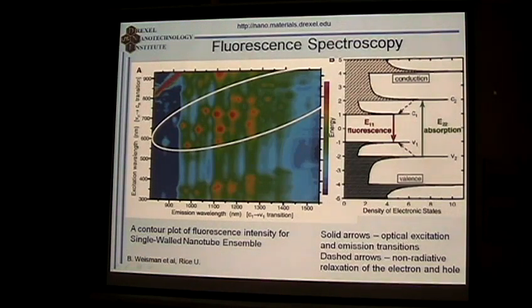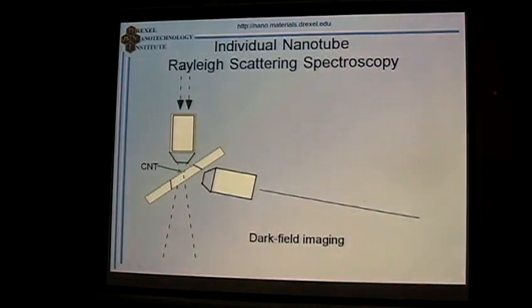So there is a way now to identify carbon nanotubes and tell exactly how many types of tubes you have in the sample, and whether your sample is strongly enriched with one type of nanotube or contains a variety of nanotubes. It can be done better than with Raman spectroscopy here. So this is a nice way to do it. It's widely used now, and as I mentioned, even instruments have become available through Bruce Weisman's company here.